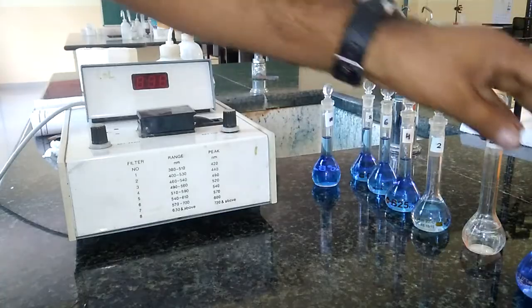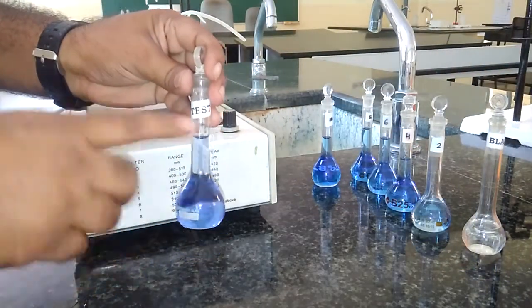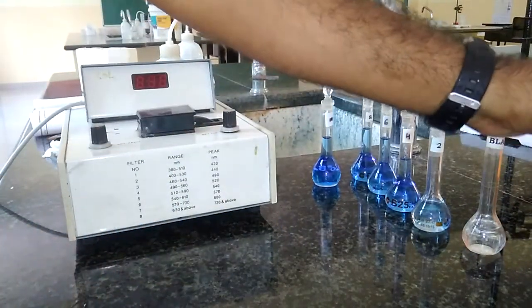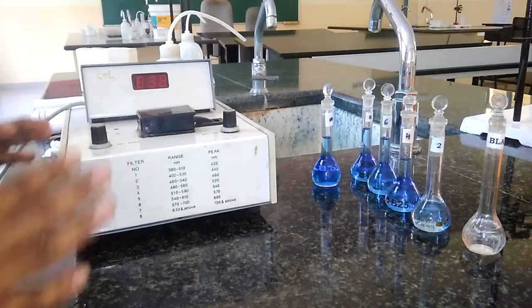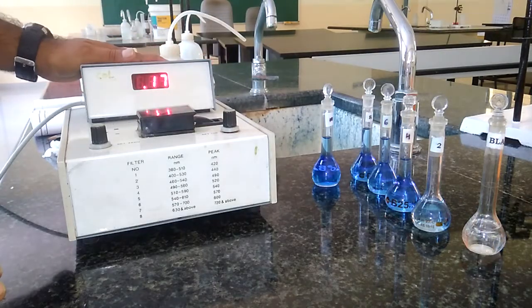Similarly, after preparing all these things, we have to get the test solution from the examiner. To the given test sample, we add 2.5 ml of ammonia and the rest is water. These are the sets of standard solution, blank solution, and test solution. After preparing this, let us switch on this instrument called the photoelectric colorimeter.